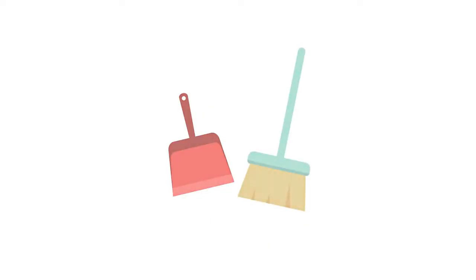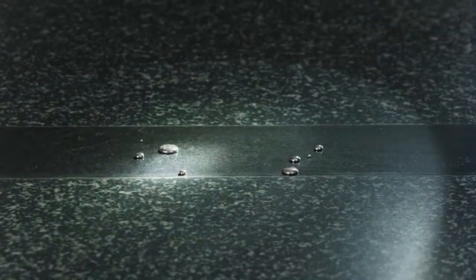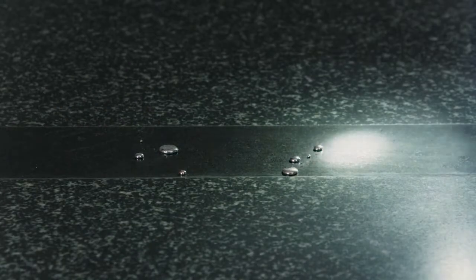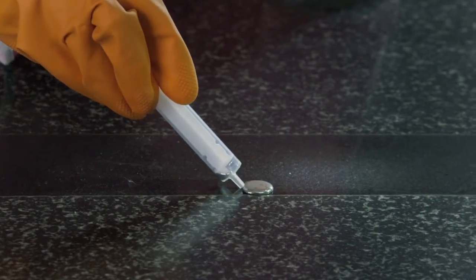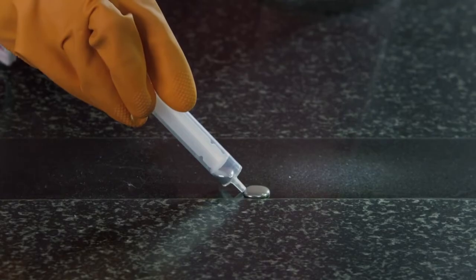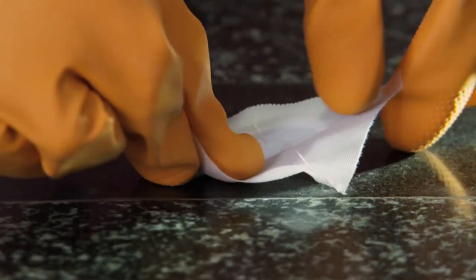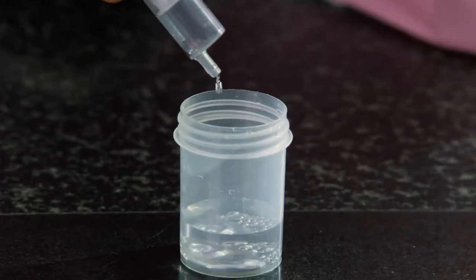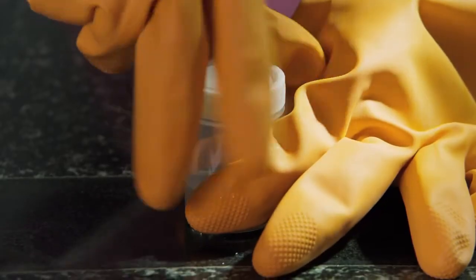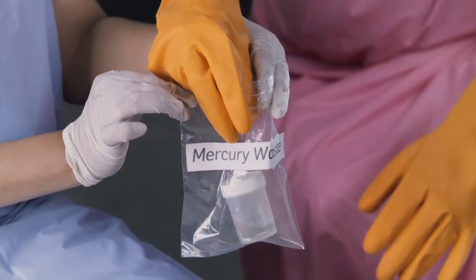Locate all mercury beads using a flashlight and bring them together using cardboard or X-ray sheets. A syringe or sticky tape may be used to collect the leftover mercury beads. Place the collected mercury in an airtight plastic container half-filled with water, then label it and send it back to the manufacturer for recovery.